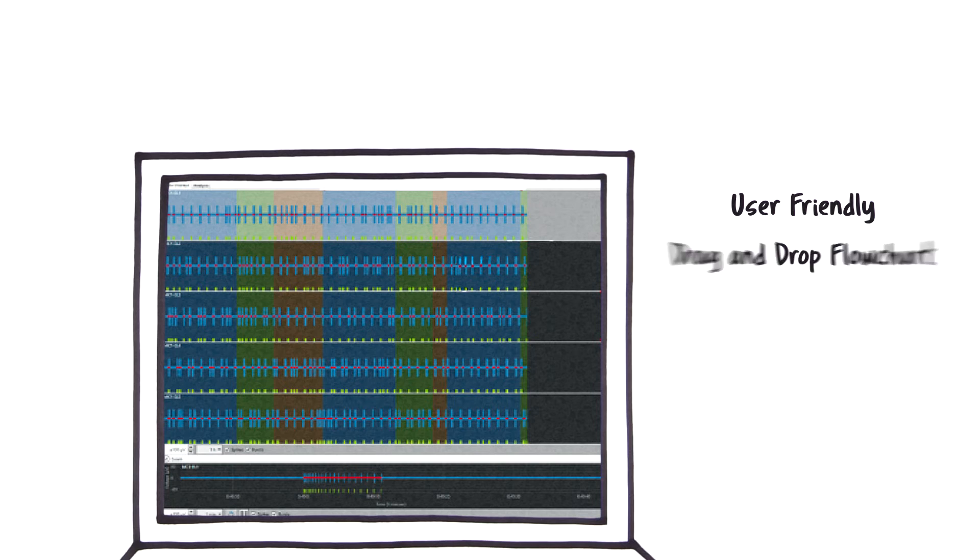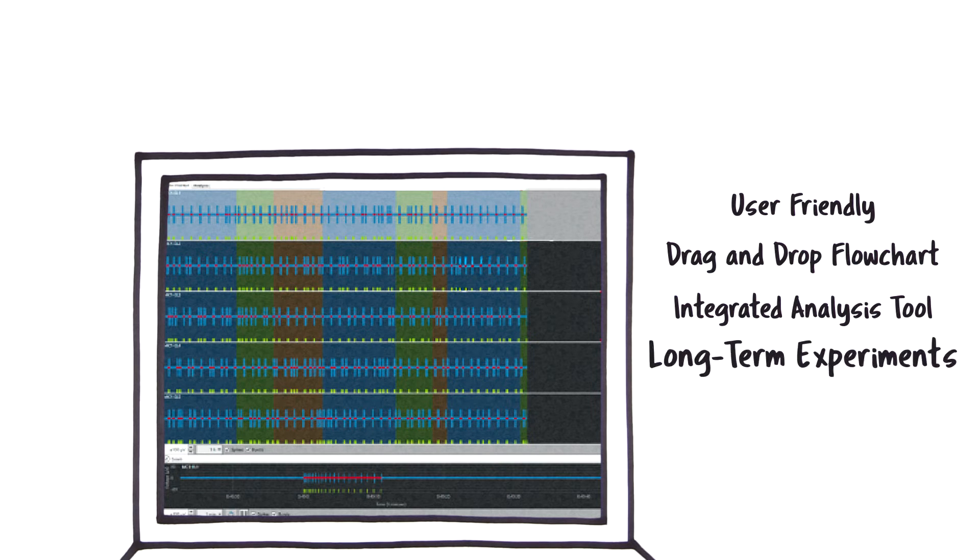With its user-friendly drag-and-drop flowchart design, BetaScreen becomes an integrated analysis tool that allows us to visualize long-term experiments with islets of Langerhans.